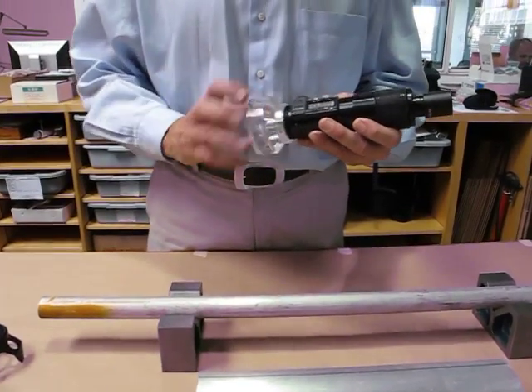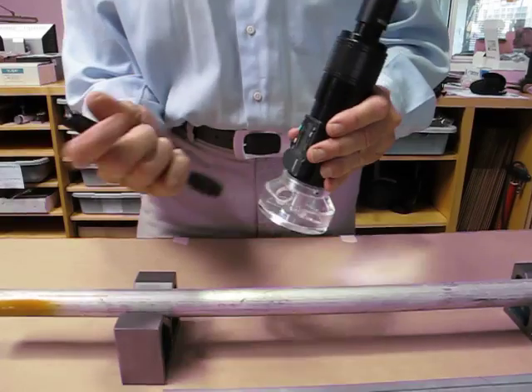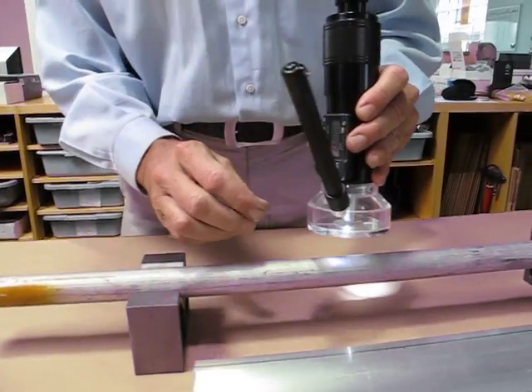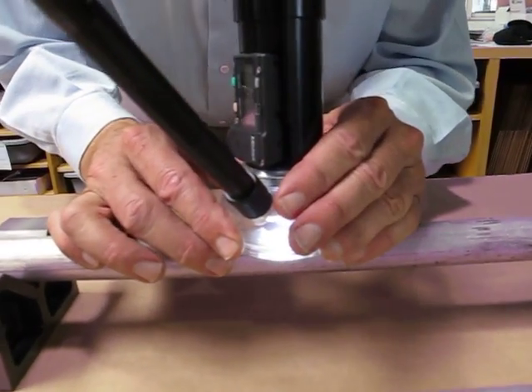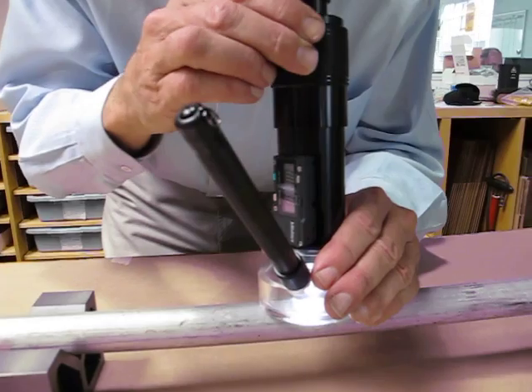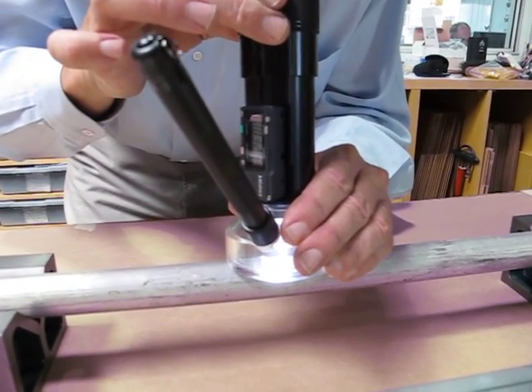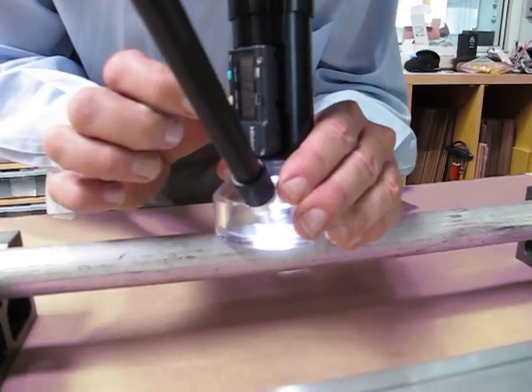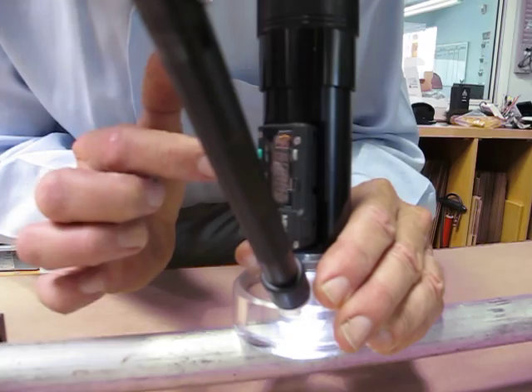We'll attach that, and I'm going to drop a light in here and focus on a defect. Find it first.